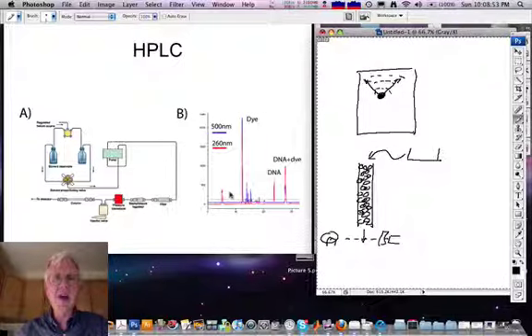And over here in this experiment, two different detectors were used. Here we were trying to couple a dye molecule to a DNA molecule. The red curve is the ultraviolet absorption of the DNA, and the blue curve is the optical absorption of the dye. What we observed with the dye alone are the peaks labeled dye. There are some other peaks here with the DNA alone, the peak labeled DNA.